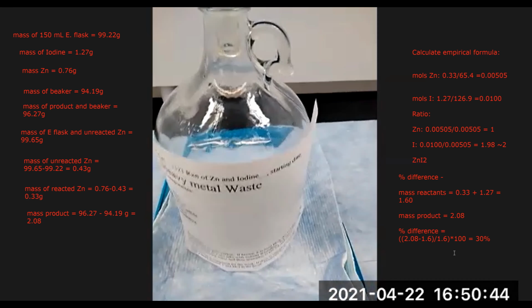One of the key culprits to this is that maybe our sample or product was still wet. So if we still had our product, we could put it back in the oven for a little longer, come back out, reweigh the product, and see if it gives us better results.